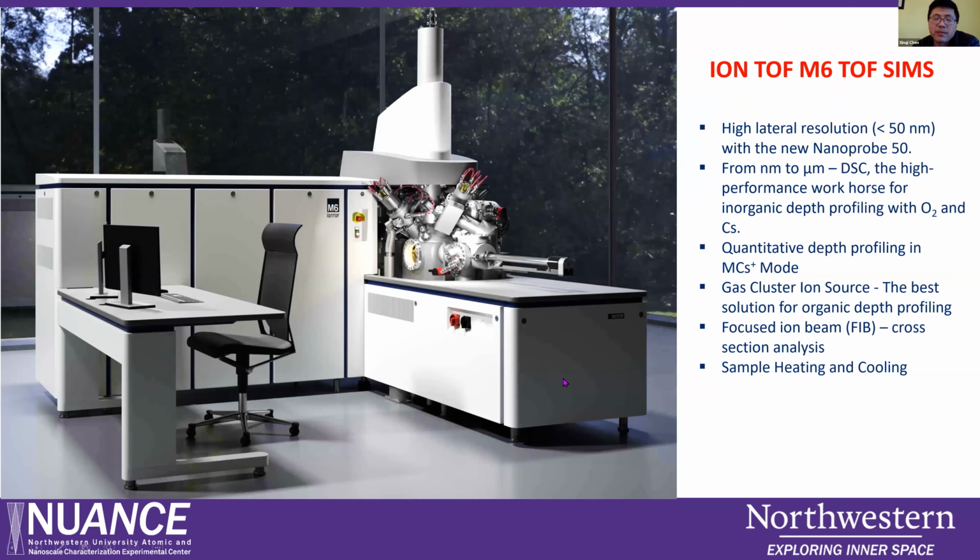Besides that, we also have another instrument, which is very fancy. We don't have it yet, but in our lab we have an older ToF-SIMS from IONTOF, which is 20 years old. It's still functional and we can get nice spectra, but that ToF-SIMS has a poor optical camera, so it's very hard to see your sample.